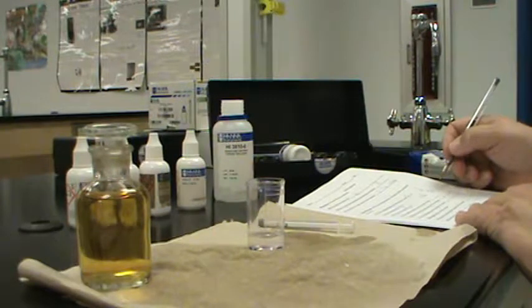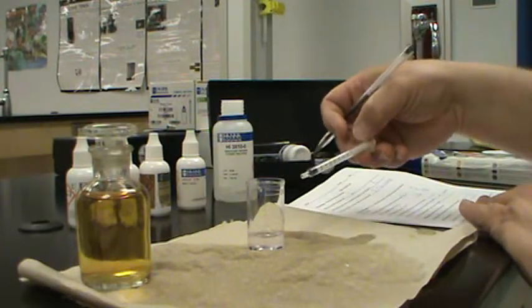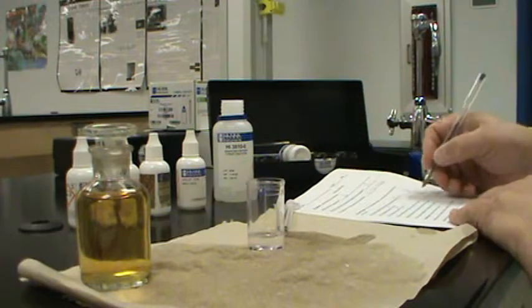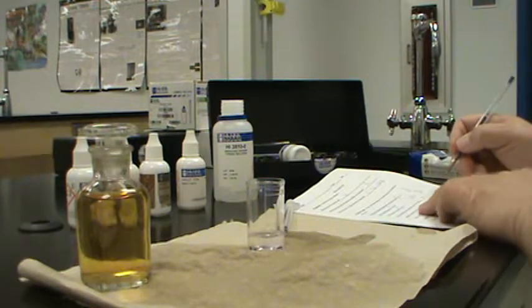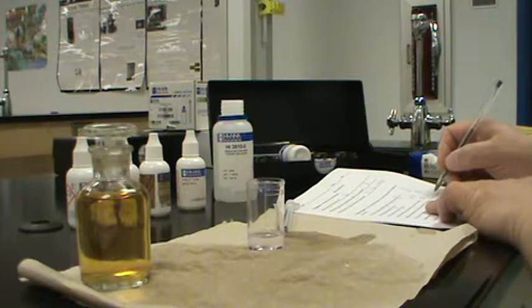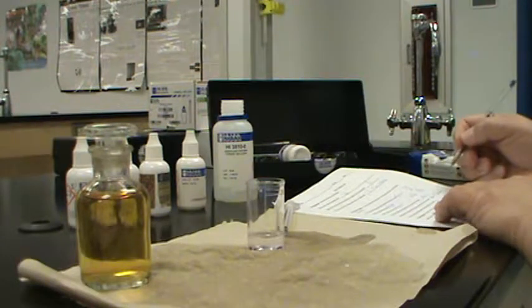So how many milliliters? It's actually 0.48 milliliters. Multiply this number by 10. 0.48 times 10, and we get 4.8 milligrams per liter of dissolved oxygen.